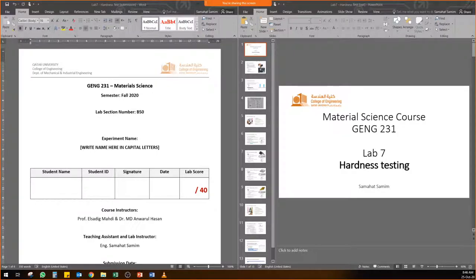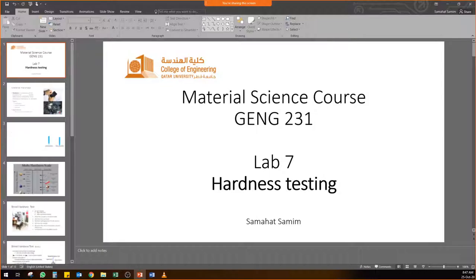for three different samples inshallah, and those three samples are the same as we tested in the tensile and in the Charpy impact. In the Charpy we only focused on steel. As in the tensile we tested steel, aluminium and brass, again we are going to test for this week steel, aluminium and brass, but for hardness. Let's see how much is their hardness.